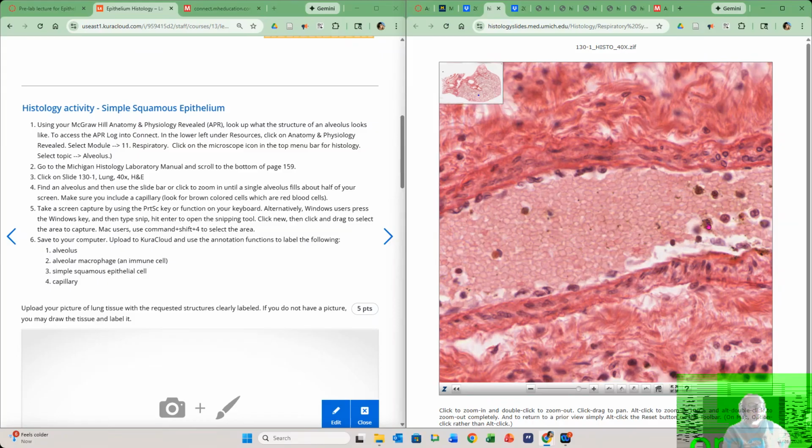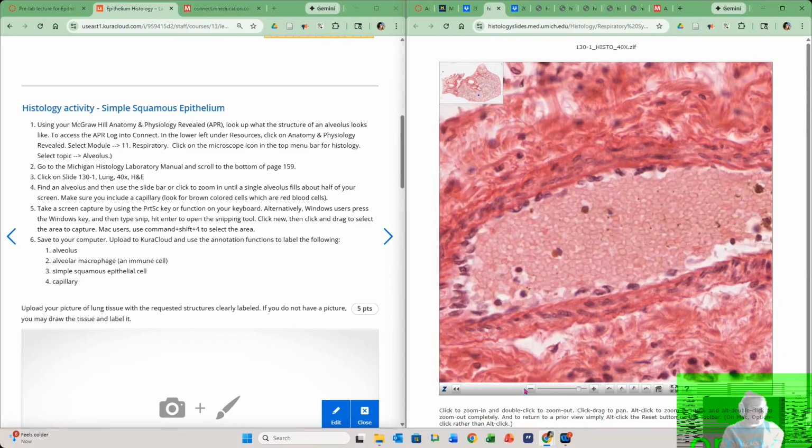The very few cells that do stain blue and are a little bit larger, those are the white blood cells. And if you look really closely, you'll see some little dark dots, and those are actually your platelets. Those are your blood platelets that help you with blood clotting. So pay attention to recognizing blood vessels because we're going to be doing that today. Bye, Balder. And we're going to be looking at blood vessels in future labs as well. Let's zoom back out a little.